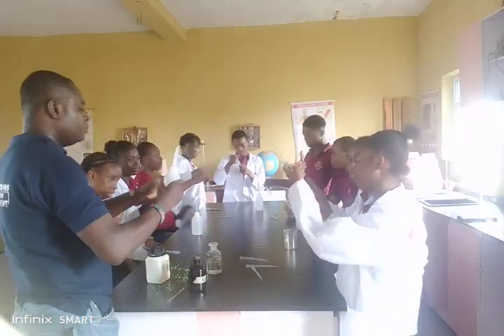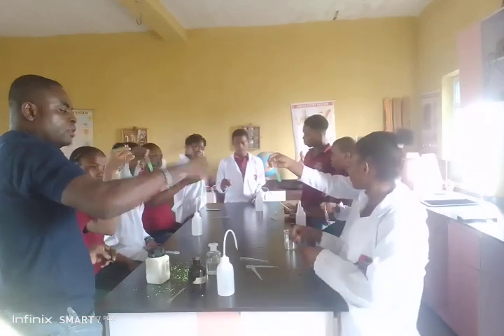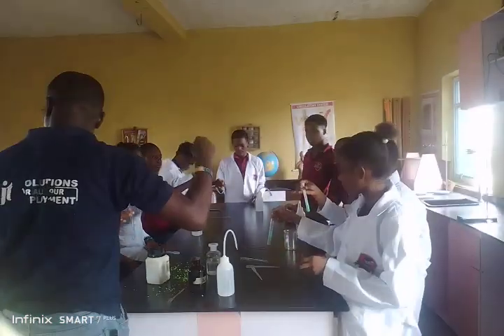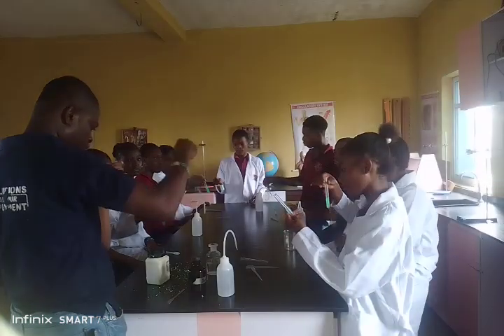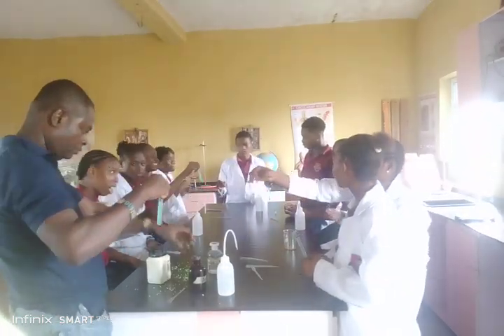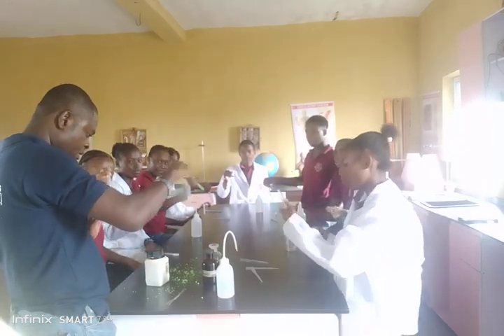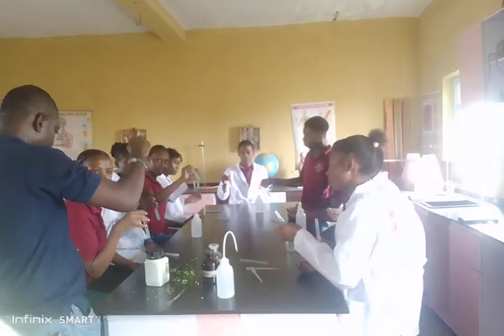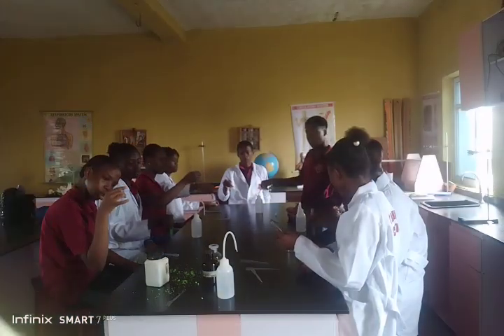Yes, more particles. Shake thoroughly. Did the thing dissolve?